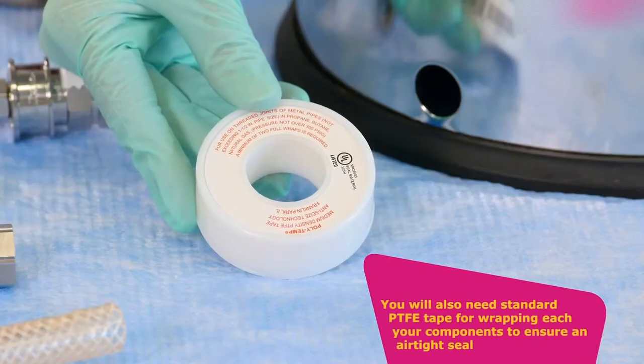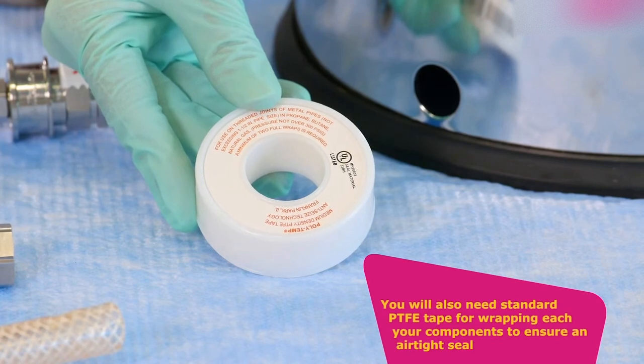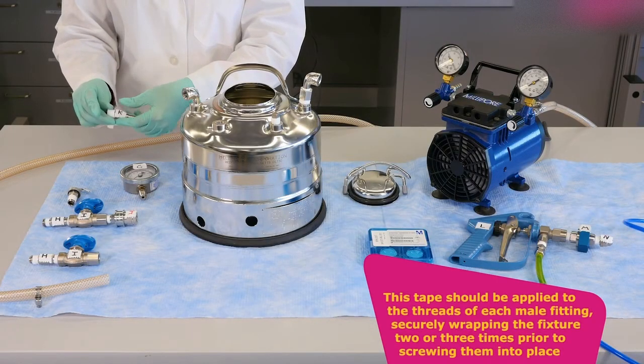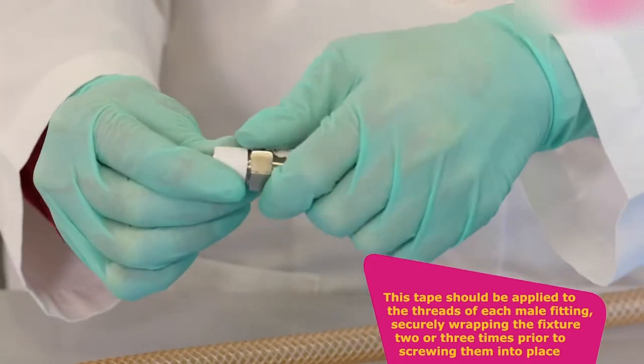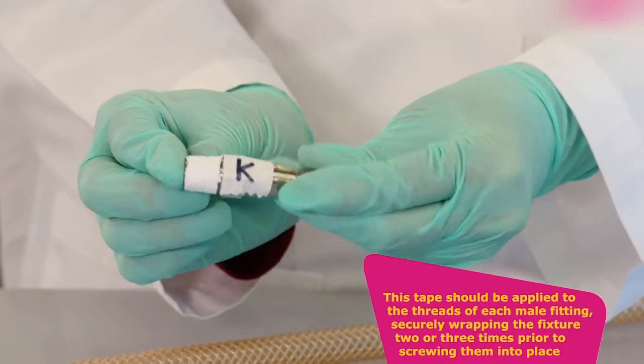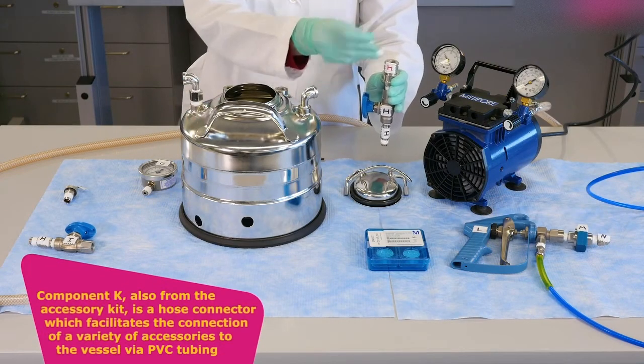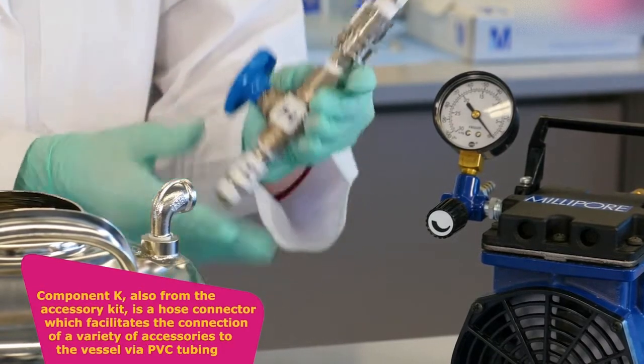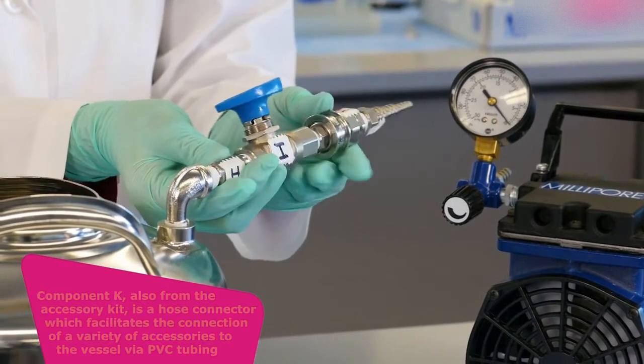You will also need standard PTFE tape for wrapping each of your components to ensure an airtight seal. This tape should be applied to the threads of each male fitting, securely wrapping the fixture two or three times prior to screwing them into place. Component K, also from the accessory kit, is a hose connector, which facilitates the connection of a variety of accessories to the vessel via PVC tubing.